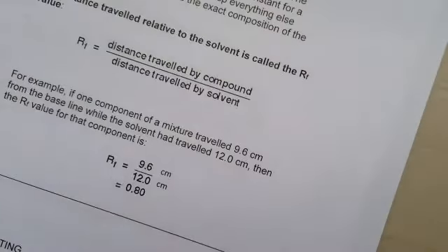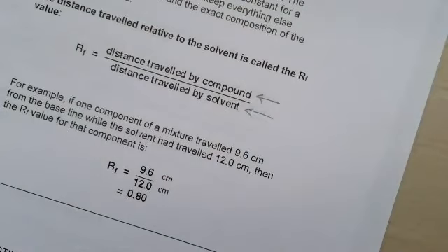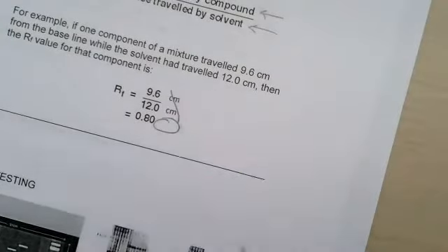The RF factor is the ratio of how far did the blob go versus how far did the solvent go. And here's an example. Notice no unit. It's just a ratio. Be careful of sig figs.